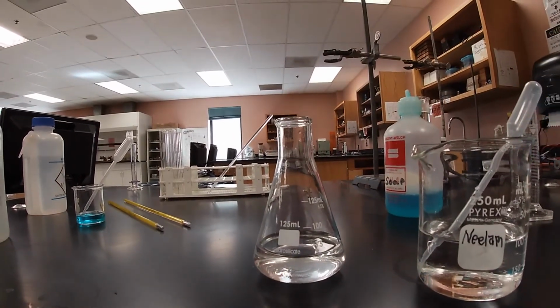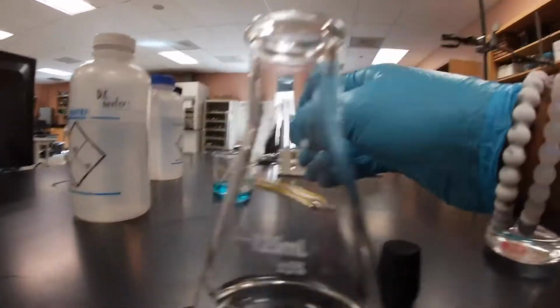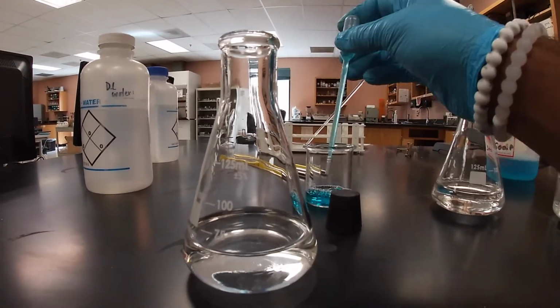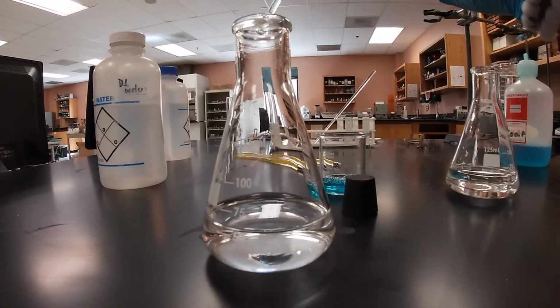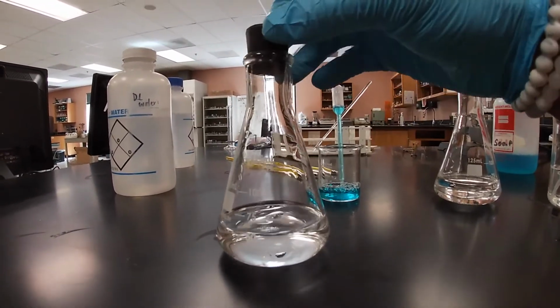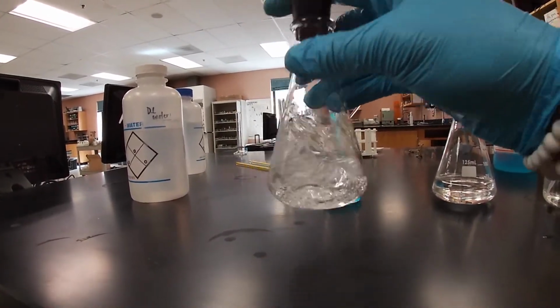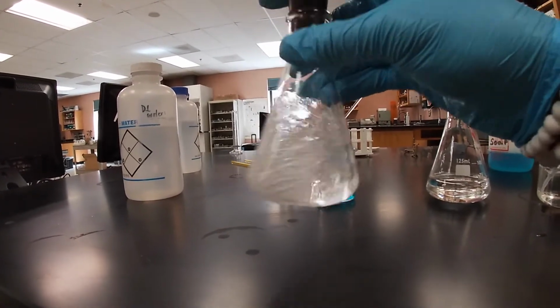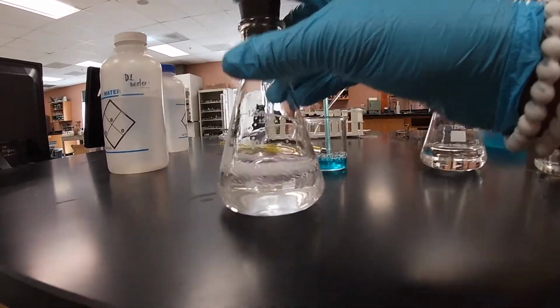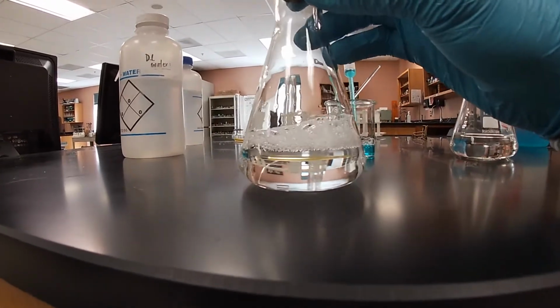And then what we're going to do now is create our standard. So here we have our DI water, and here we have some soap. So we're going to add 1 drop. We're going to get our soap, add 1 drop of soap. And then we're going to close it and shake it for 10 seconds. 5, 6, 7, 8, 9, and 10. And so we are waiting for it to create that suds layer.